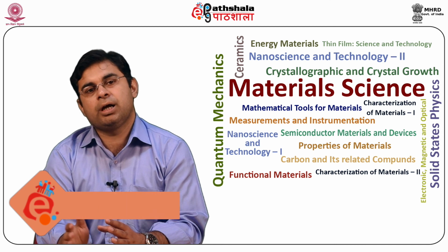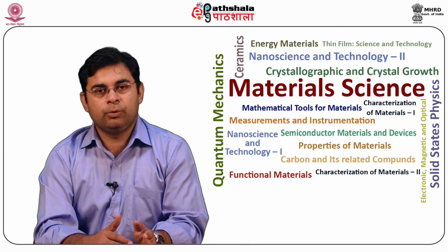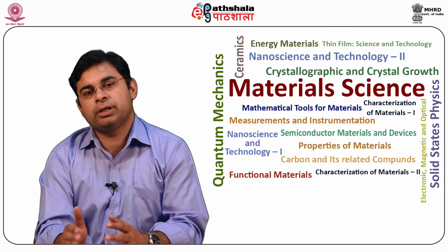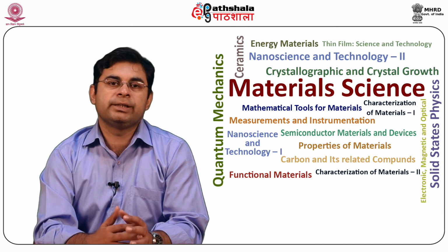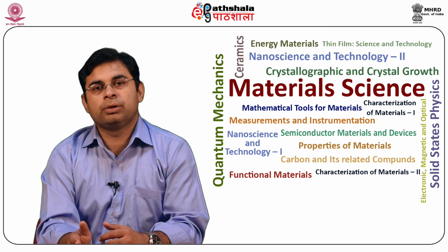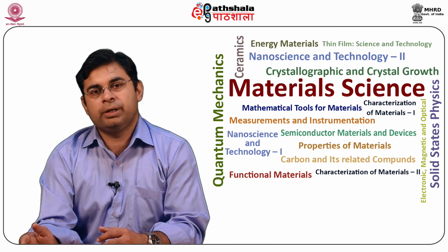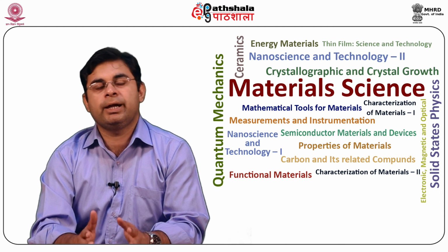Thereafter, we studied two imaging modes: constant height mode and constant current mode. The second technique we studied is atomic force microscopy, where we studied the basic design of the instrument along with two kinds of imaging modes, contact mode and tapping mode.